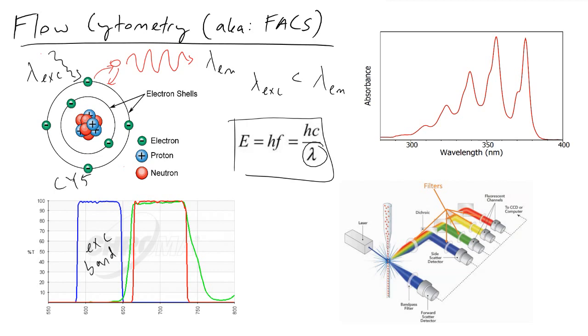And when these photons in this excitation band are absorbed by your sample, by your fluorophore specifically, your fluorophore is going to release, it's going to emit a photon of a lower energy that has a higher wavelength or a greater wavelength. And so this would be your emission band or EM band. And so in this emission band, this is where we can have detectors. And if we are seeing photons come out of our sample that are inside of this emission band, then we can conclude that these fluorophores must be present inside of your sample.